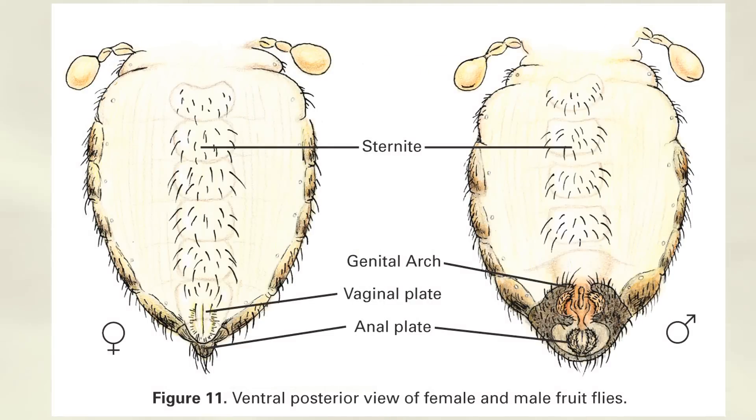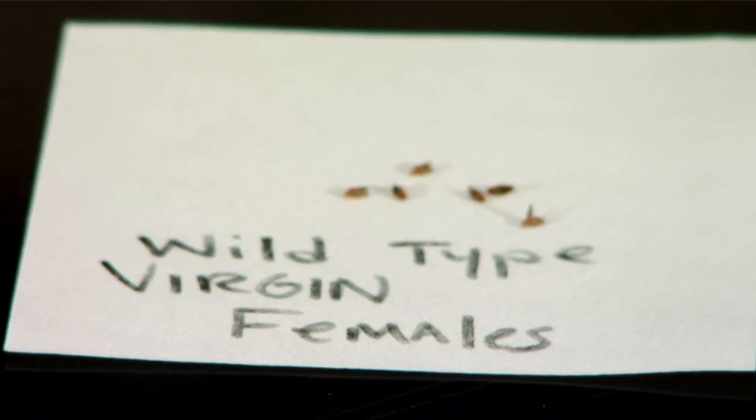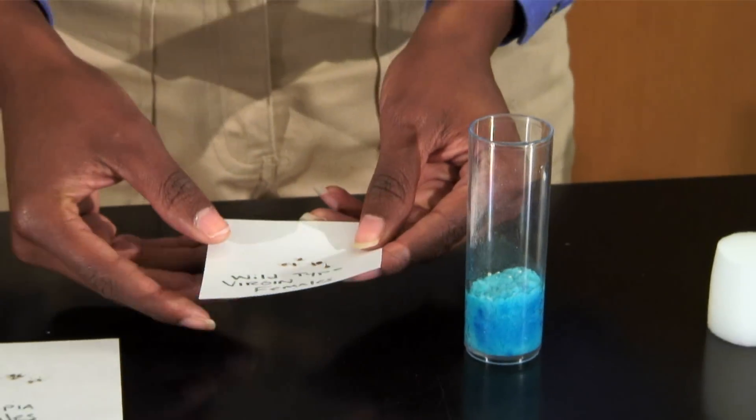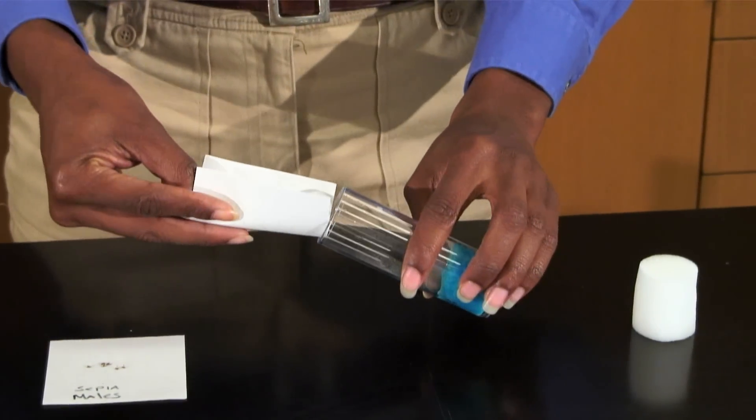Sexing flies is important when culturing Drosophila and making genetic crosses. Once all females have been confirmed as virgins, anesthetize them and the males needed to perform the cross. Add six virgin females and males to each new vial.